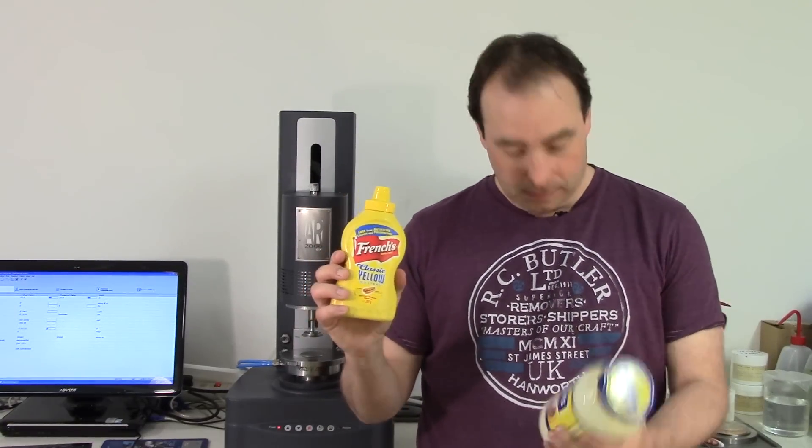It's the measurement of this structure that makes rheology such a powerful technique when compared to simple viscosity measurements. One mustard, one mayonnaise, one decent rheometer. Let's do some rheology.